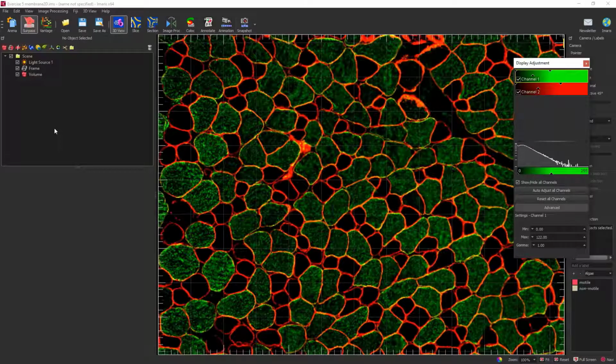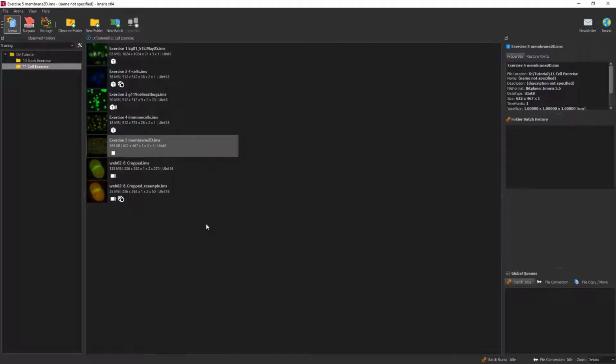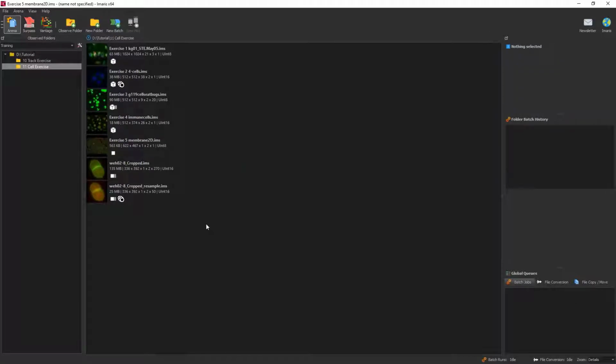As long as you can resolve an independent cell through time and it's not blurred into the background or completely squished together with an entire mass of other cells, as long as it's resolved as a separate entity and you can place either a spot or surface on it, we can track that individual particle through time. Yep, exactly. You've got to be able to find an object first, and then you can track it. And that was a beautiful image.